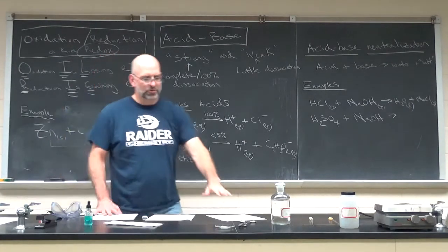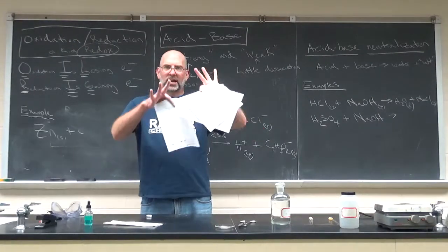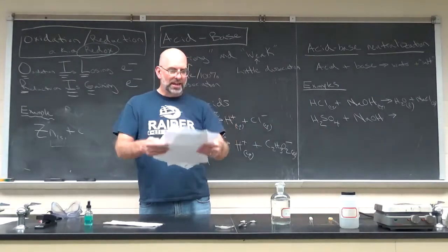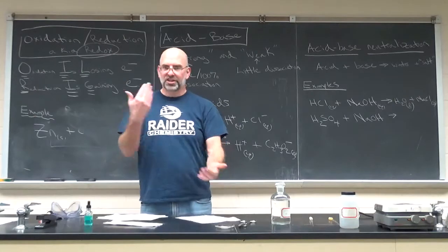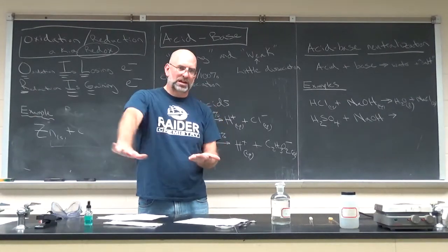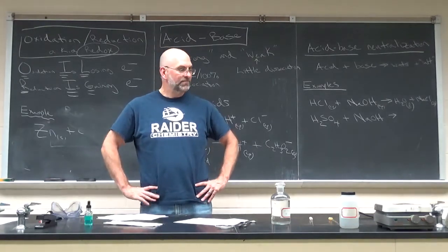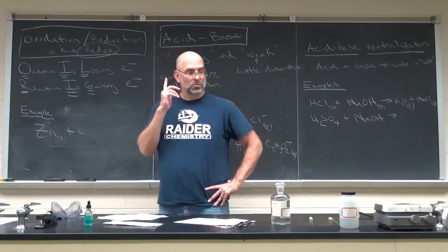So again, to reiterate, see how much of this you can write up ahead of time, and as soon as you come into the lab, just get started with reactions 1 and 2 under redox and go as quickly as you can, and we'll make some game time decisions about getting you the data. I think that's it. So good luck, and we'll see you in lab.